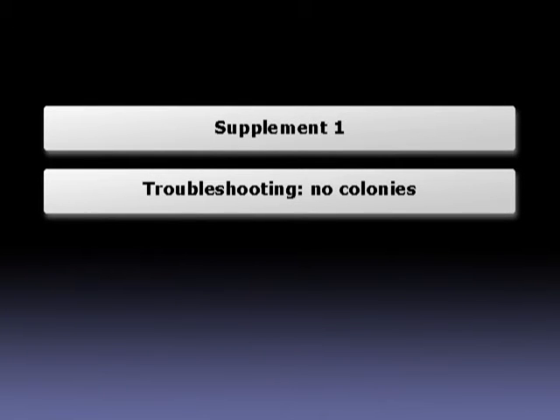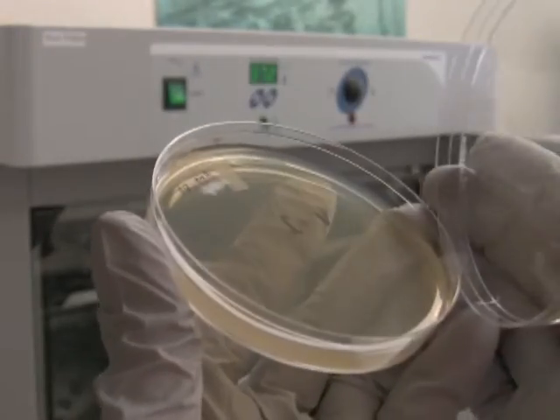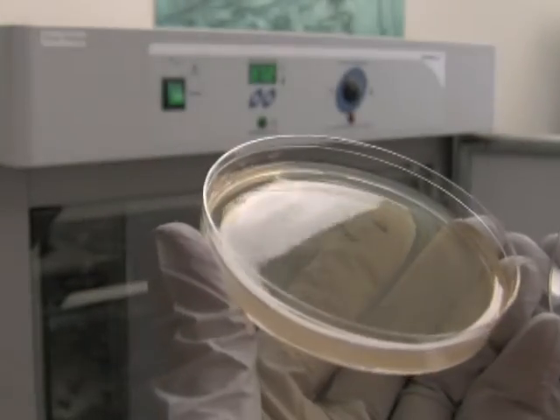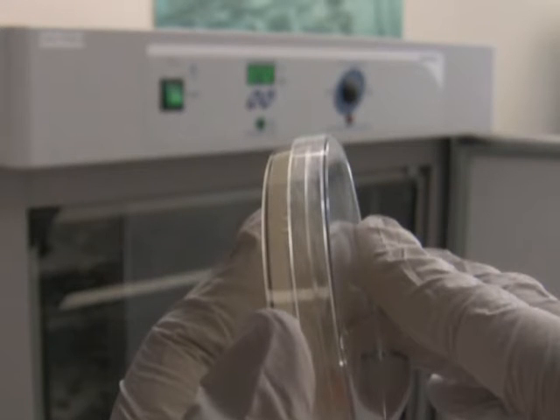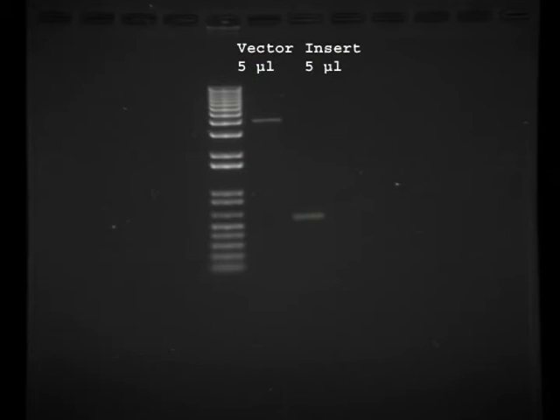In this troubleshooting supplement on 'no colonies' syndrome, when you don't get colonies from the first cloning attempt, I want to suggest a couple of ideas. The first deals with no colonies on your vector plus insert plate the next day after transformation. In most cases, the lack of colonies can be tracked to lost DNA — either the vector or the insert. To test that, prepare an agarose gel and run 5 microliters each of the vector and insert DNA. On this gel picture you can see relatively intense bands for both vector and insert. However, if one of your DNA fragments is barely visible or missing, it would most likely cause low efficiency of ligation. If that's the case, try to identify the step where you lose the DNA, or prepare the DNA fragment again.